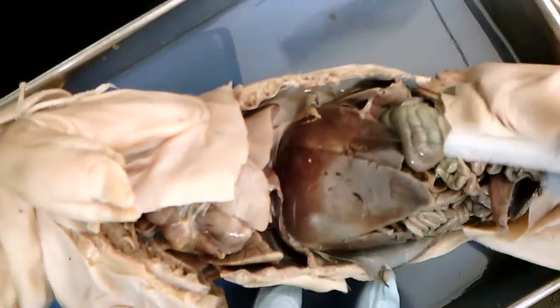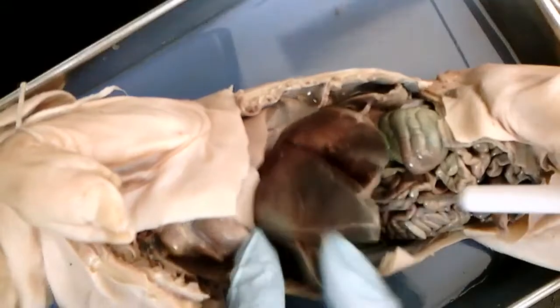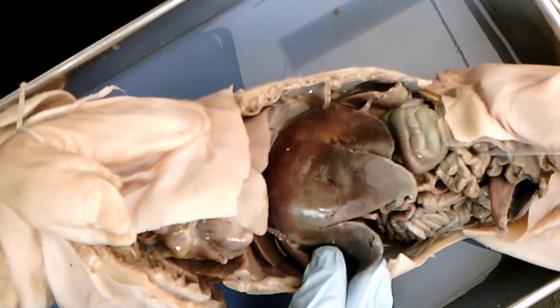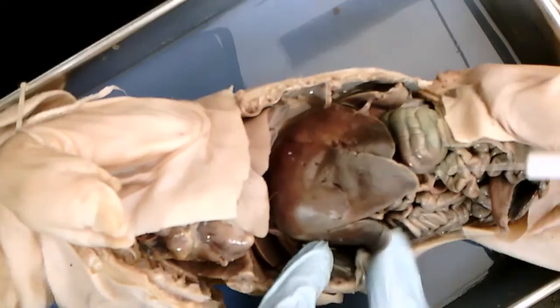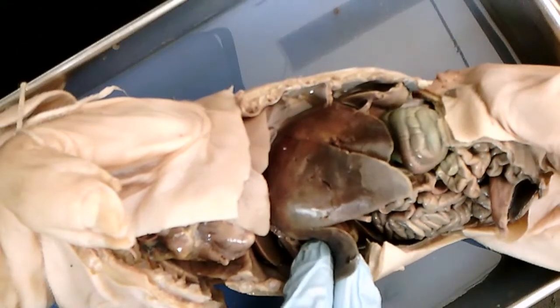So this liver, well, students need to know the function for the practicum. For the practicum, students will need to know the function. There's going to be some multiple choice questions that are specifically associated with the function. And they're also fair game on the test that they take individually as well.